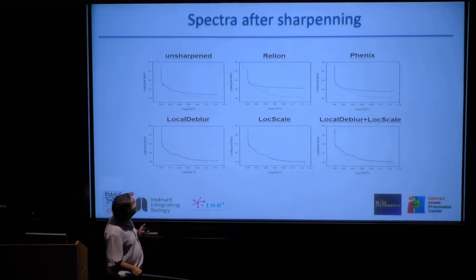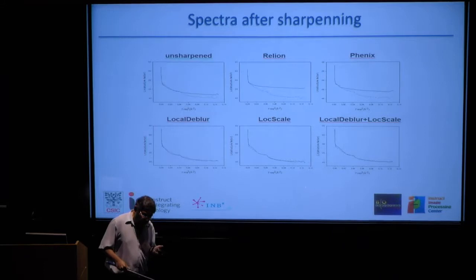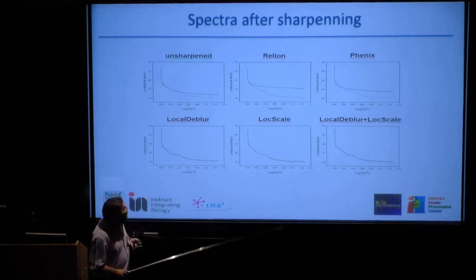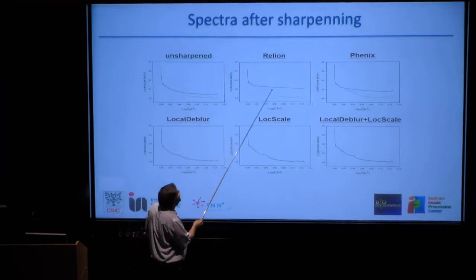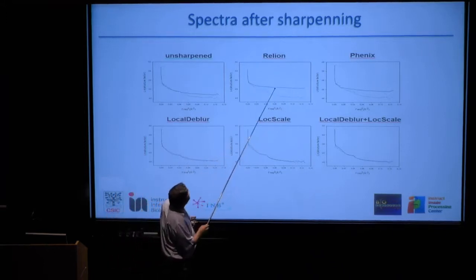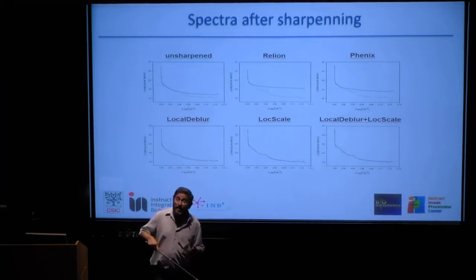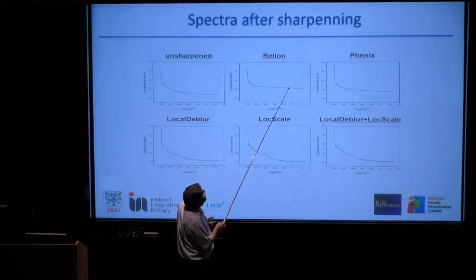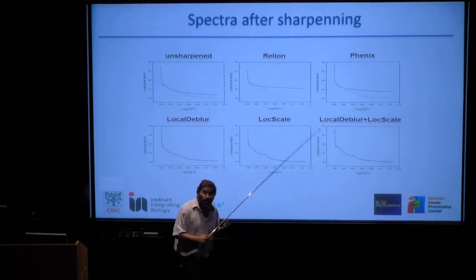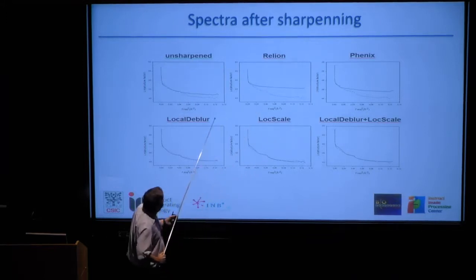And when we check actually at the level of the spectra of these maps what is happening, what we find in most approaches is that there is a tendency to put this B factor general boosting of high frequencies that is typical of many methods.